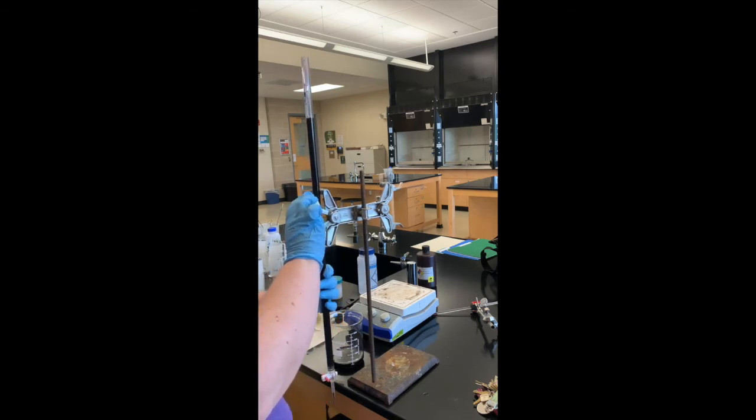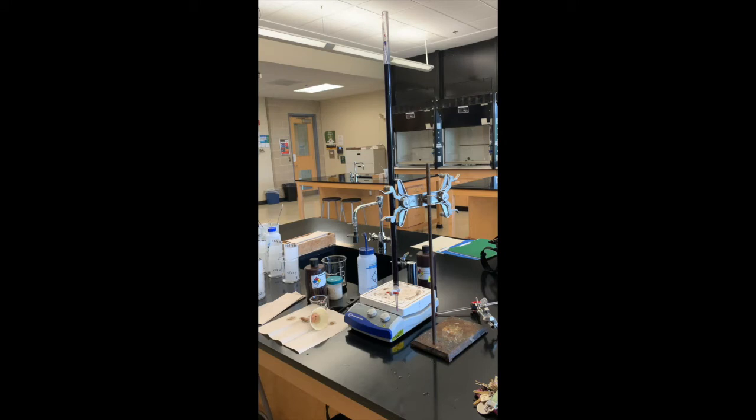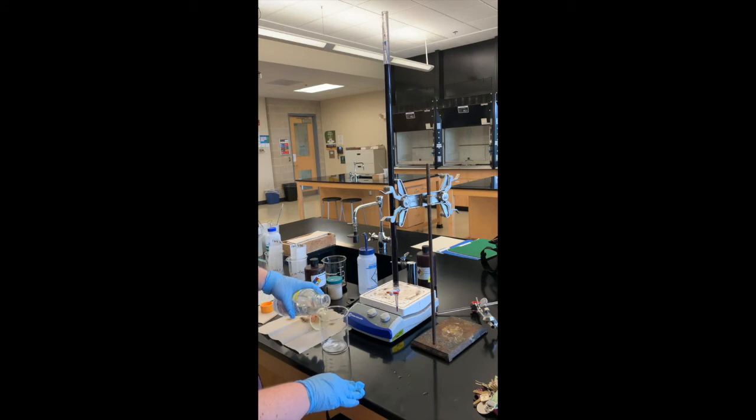Moving on to Part B, this is where the titrations start happening. In Part B we're going to titrate a sample of sodium oxalate. You can see the PowerPoint for how to calculate the exact amount of sodium oxalate you're using. We're going to dissolve the sodium oxalate in about 170 milliliters of sulfuric acid — this doesn't have to be a super exact amount, so I'm just using the markings on the beaker.